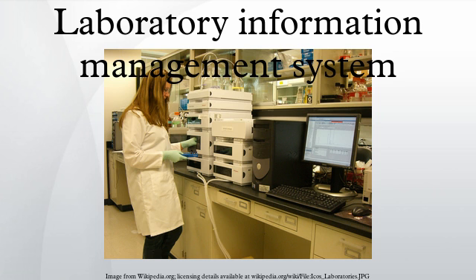Standards. A LIMS covers standards such as 21 CFR Part 11 from the Food and Drug Administration, ISO IEC 17025, ISO 15189, Good Laboratory Practice.